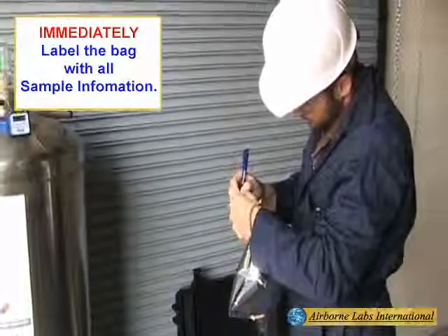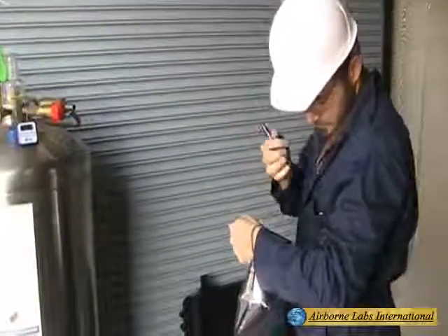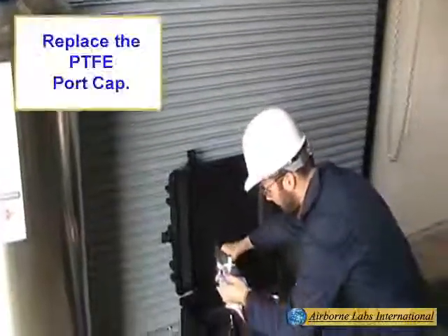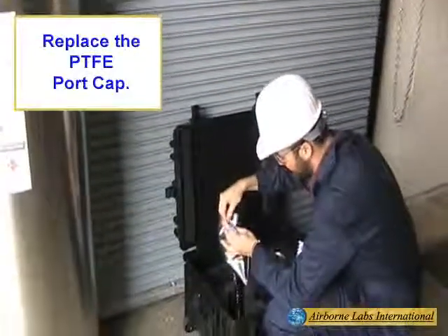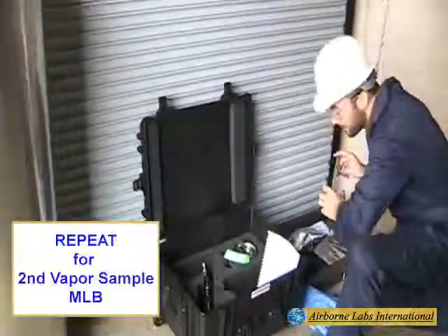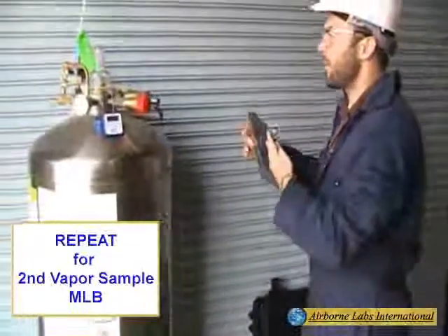Immediately label the MLB with all sample identification information, then replace the PTFE port cap. Repeat this process for the second MLB bag.